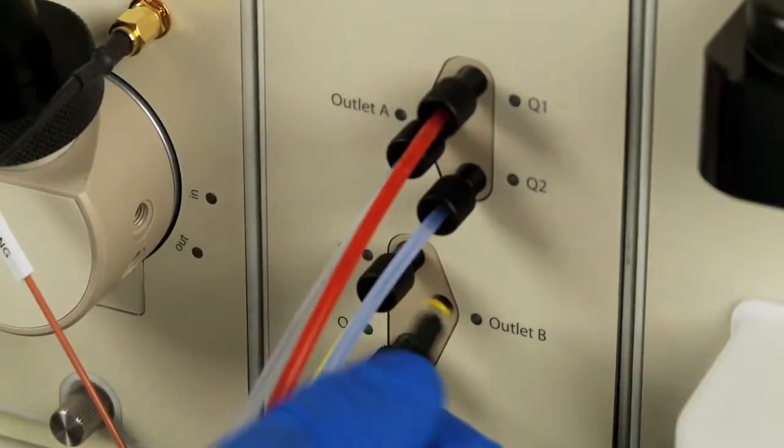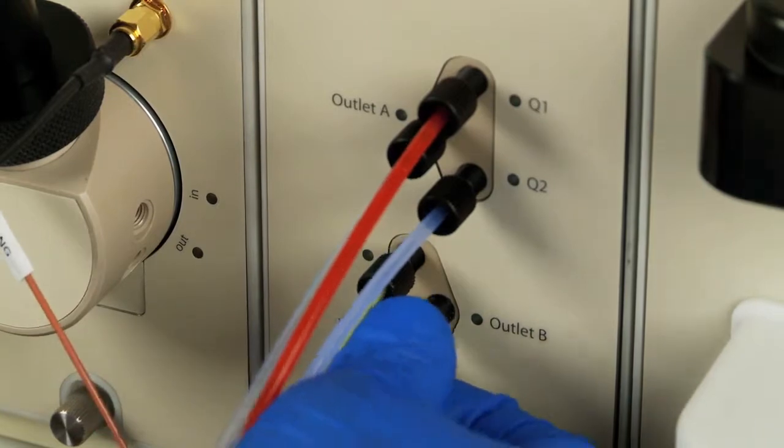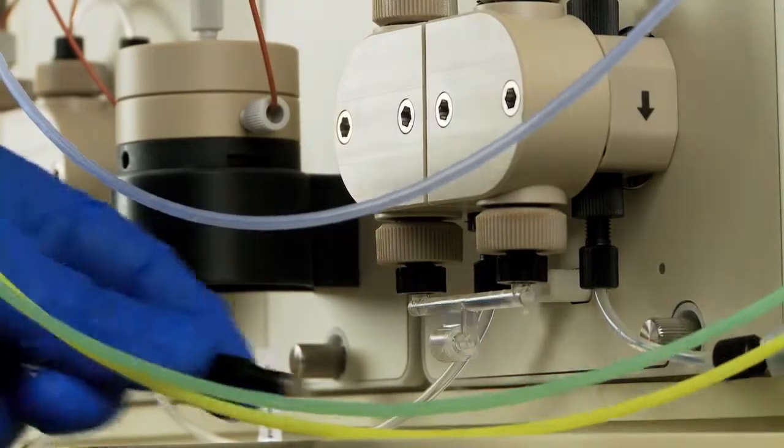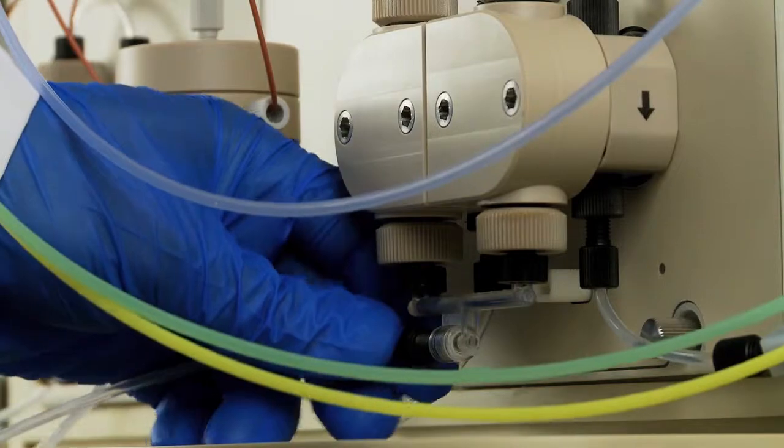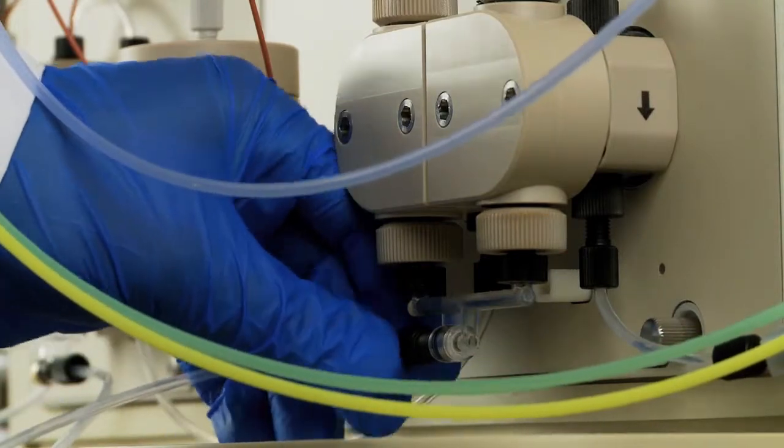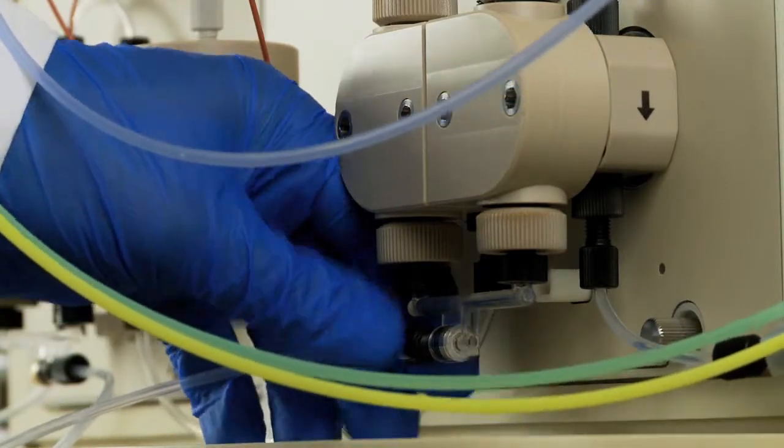Attach line Q outlet to port B on the buffer blending valve and then attach the other end to the inlet manifold on pump B. Securely tighten the fittings to ensure a proper seal and prevent buffer leaks.